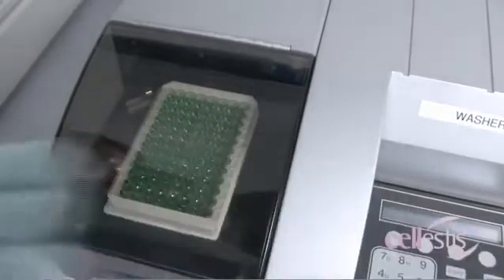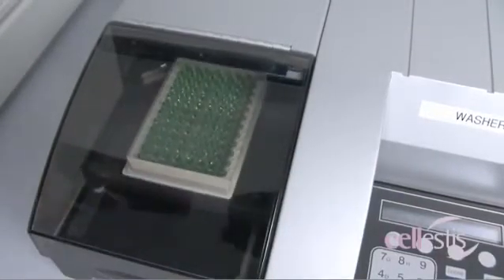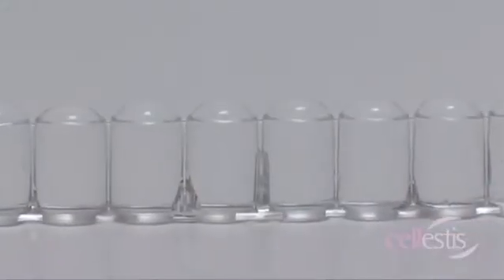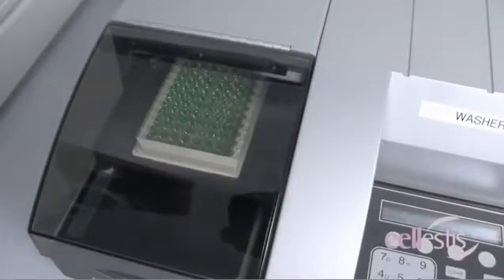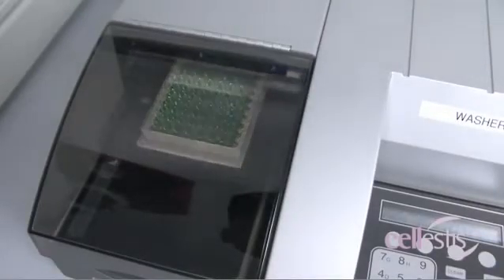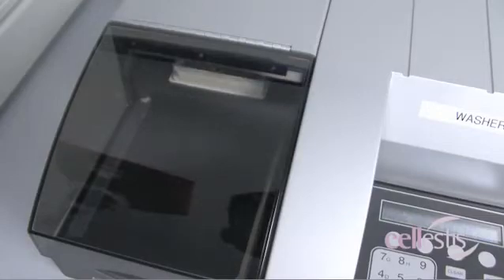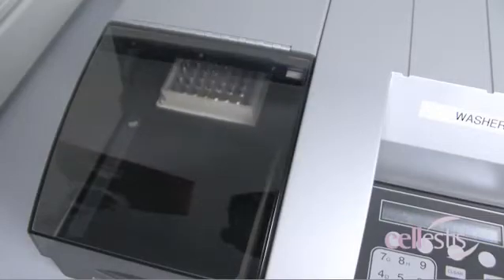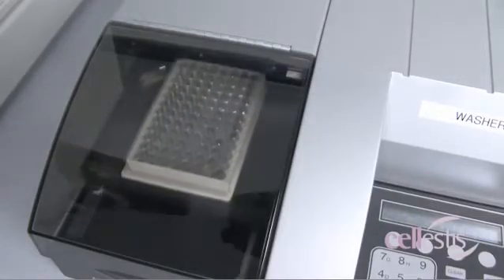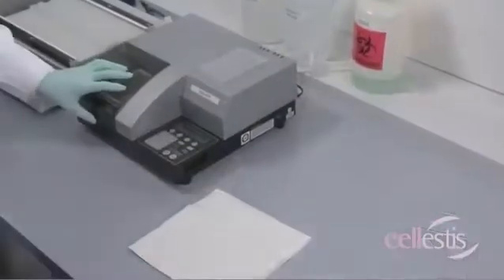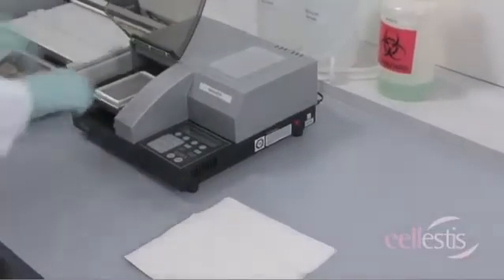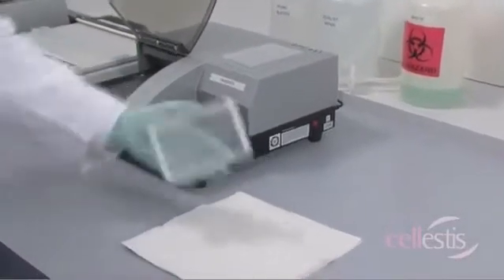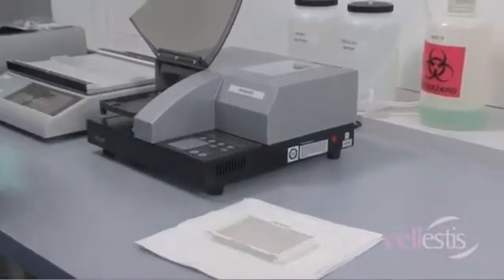During each wash cycle, every well should be completely filled with wash buffer, showing a positive meniscus. A soak period of five seconds between cycles is recommended. After washing, remove residual wash buffer by tapping the plate on an absorbent wipe.